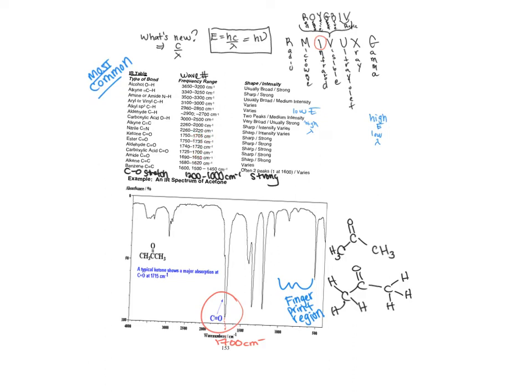So you're not necessarily going to tell exactly which one's which. You have to be a little flexible. But the important thing is that all the different carbonyl functional groups fall somewhere around 1650 to 1750. So right smack at 1700 is definitely a carbonyl. Very strong, very characteristic.